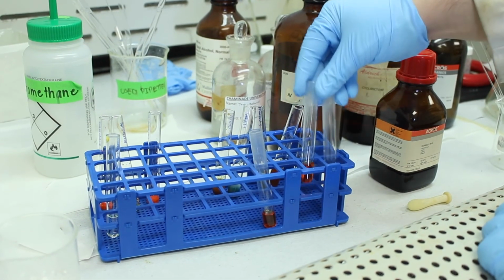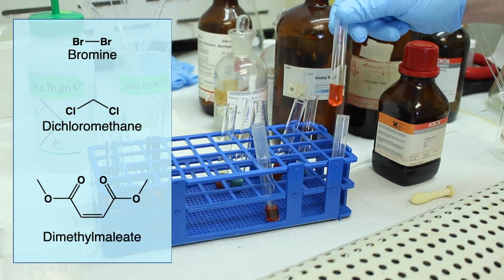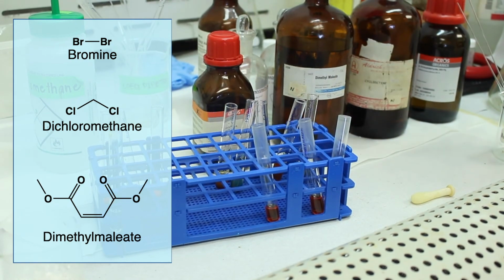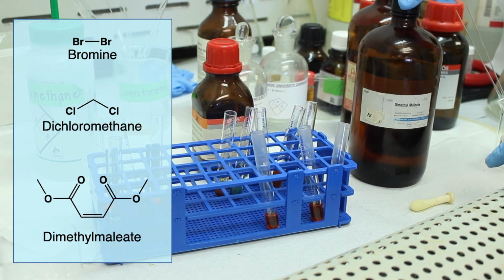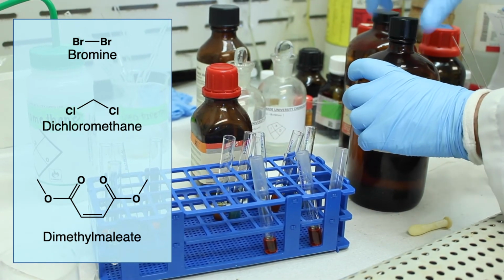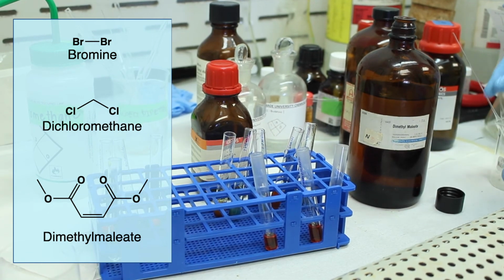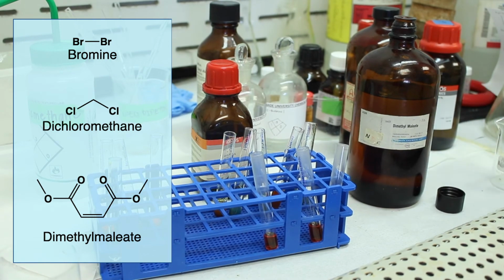All right, so now we've got our dimethyl maleate to consider. Our dimethyl maleate has a double bond, and you'll see the structure here. It has electron withdrawing groups on it. Those electron withdrawing groups will withdraw electron density from the double bond and make it less nucleophilic. So at room temperature, we expect it not to react. So take our pipette here. Oops, this pipette is a little broken.